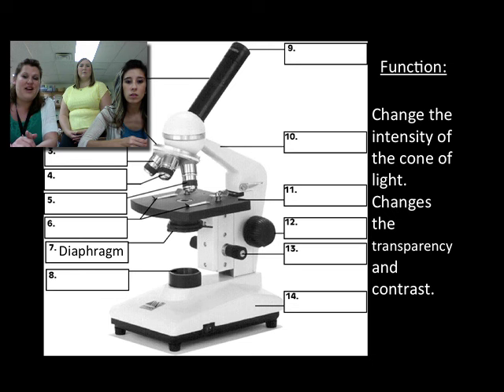This is the diaphragm. It changes the intensity of the cone of light that comes through and changes the transparency and contrast. If you need to adjust that to see your image better, that's what you would use.